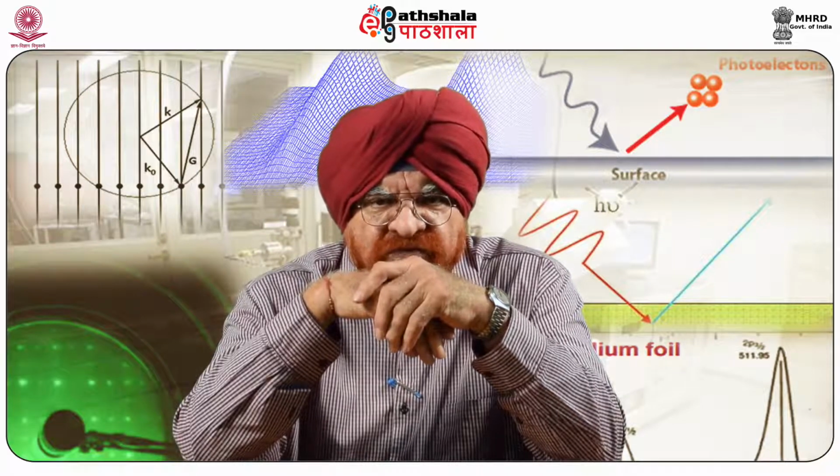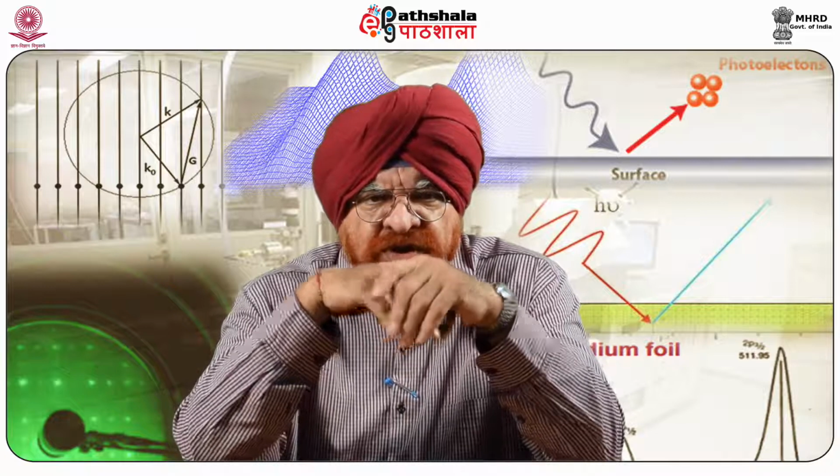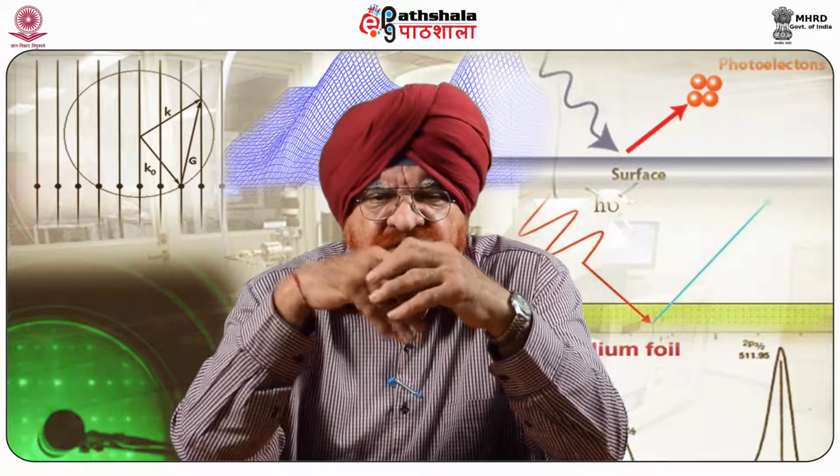Compared with optical interferometric microscopes, optical profilers, the AFM provides unambiguous measurement of step heights independent of reflective differences.